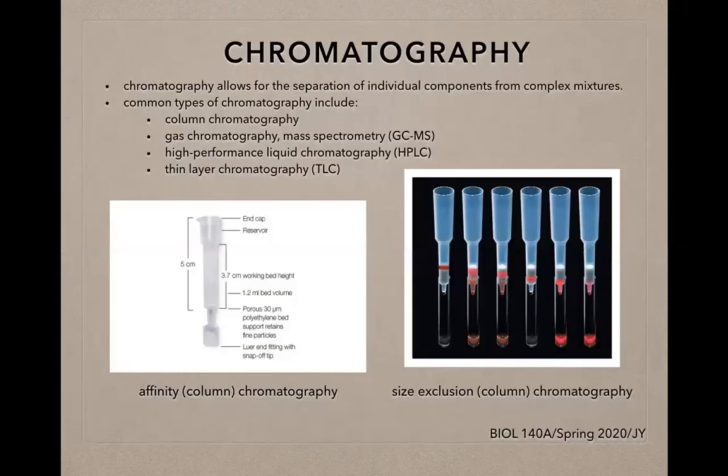Next, I'd like to go over chromatography. Chromatography allows for the separation of individual components from complex mixtures. There can be many different types of chromatography. For example, column chromatography.